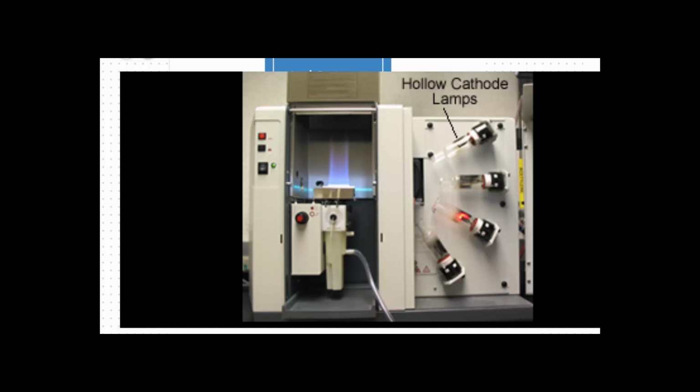Now, with the atomic absorption, we're talking about the absorption here. We do have to use these lamps, and it can be very specific, looking for your particular wavelength, or you can have a machine that has like these 4 different lamps. And honestly, I haven't seen one with 4 lamps, but it's been a while since I've run an AA. Mine had 2.